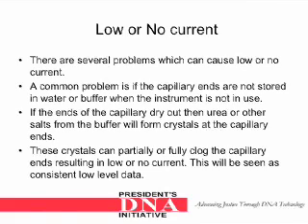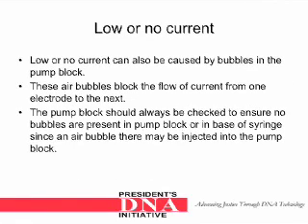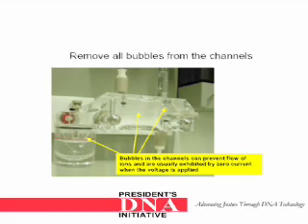This will be seen as consistent low-level data. Low or no current can also be caused by bubbles in the pump block, which block the flow of current from one electrode to the next. The pump block should always be checked to ensure no bubbles are present in the pump block or in the base of the syringe, since an air bubble there may be injected into the pump block. Depicted in this diagram are several areas where bubbles can be formed in the pump block. Bubbles in the channels can prevent flow of ions and are usually exhibited by zero current when the voltage is applied.